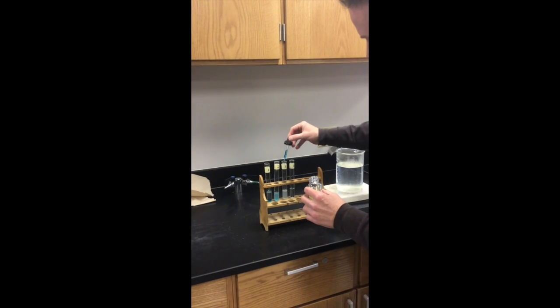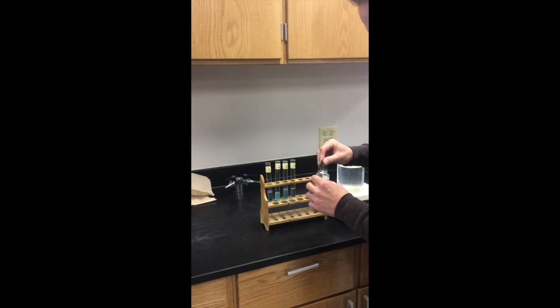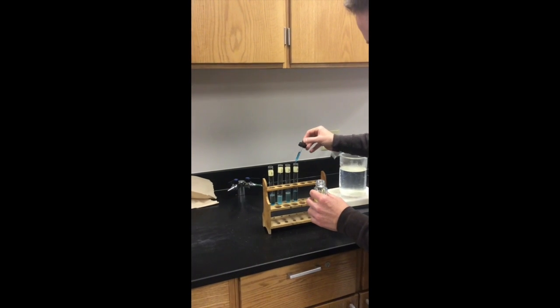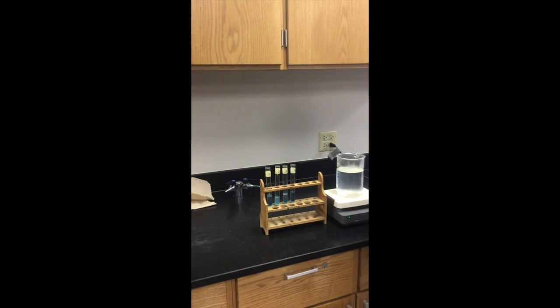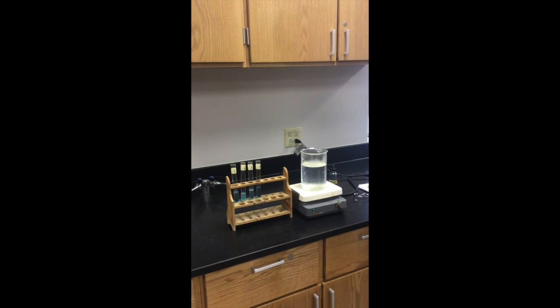And this one's got to involve some heating, so we're going to have to wait for the results until after it's been heated for about 10 minutes. All right, so you can see we have a hot plate, and this is heating water.